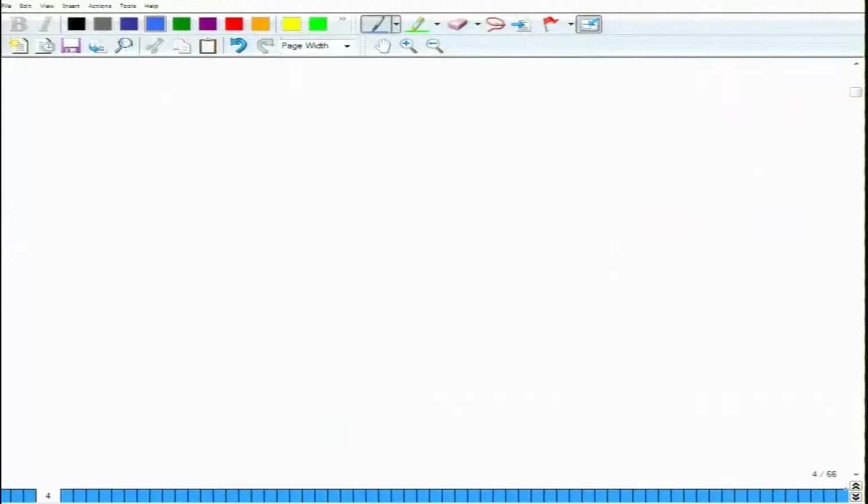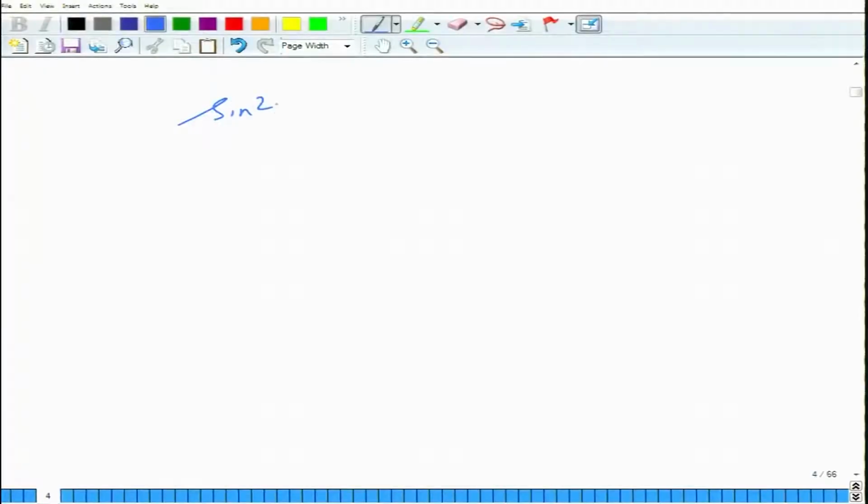And we did a simple analysis as well, where we took a table of Bragg angles, which we converted into sin square thetas, because we know that sin square theta is proportional to h square plus k square plus l square, and h square plus k square plus l square must be an integer.